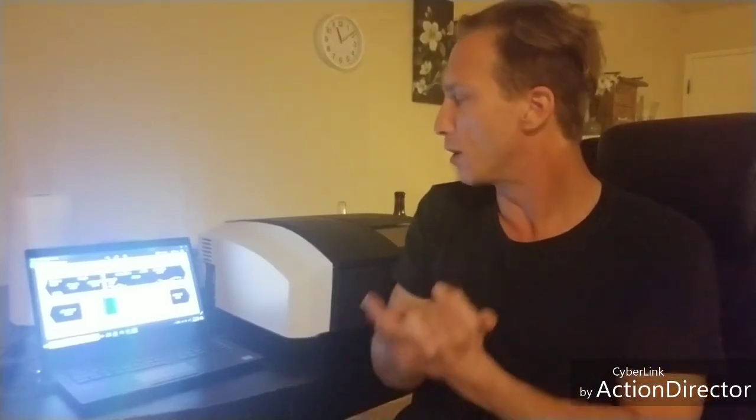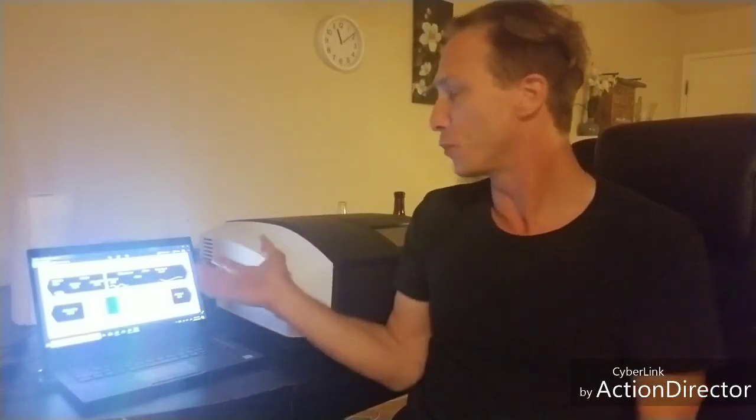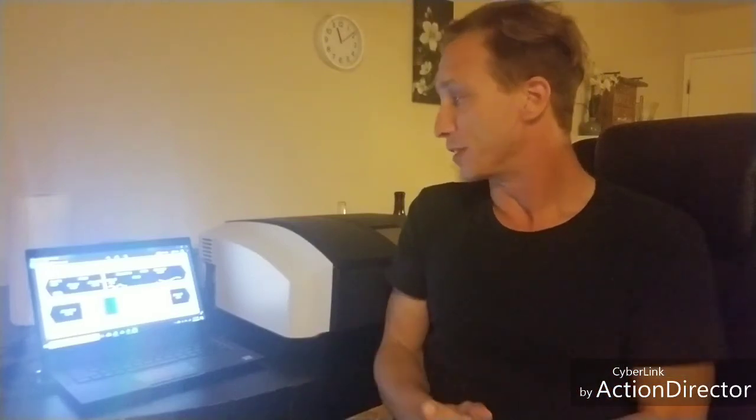And all of these have different wavelengths, and depending on the wavelength will depend on what type of matter can first generate them, and second, what type of matter they will affect. So, for example, visible light is going to affect electrons in orbit around nuclei, whereas something like infrared light is going to affect the vibrations of molecules and things like that.